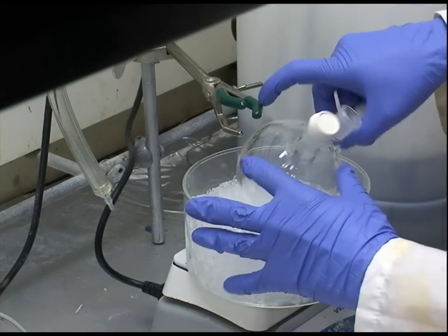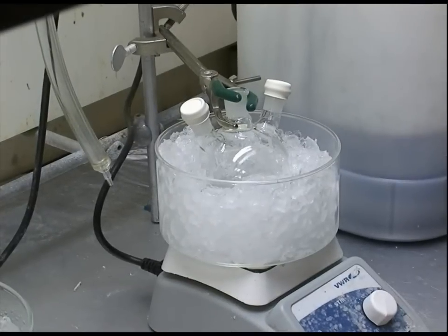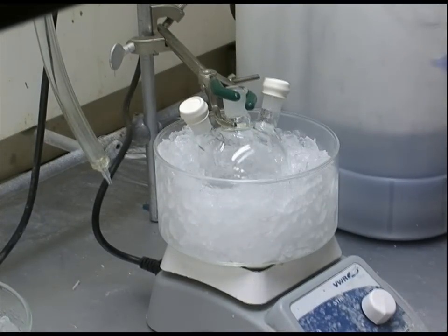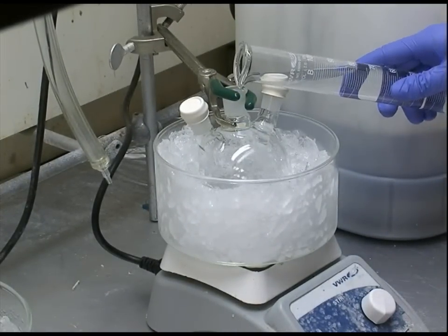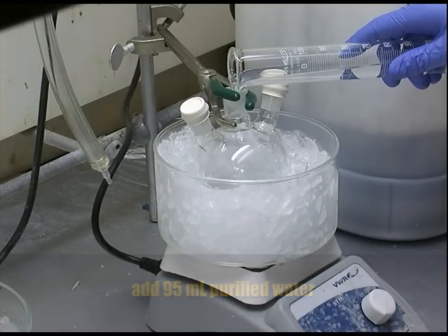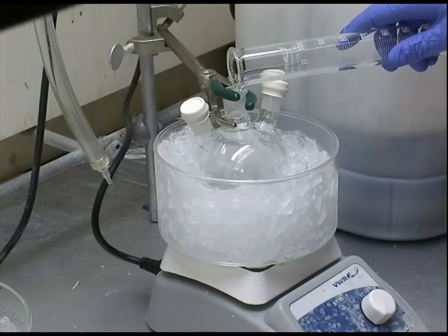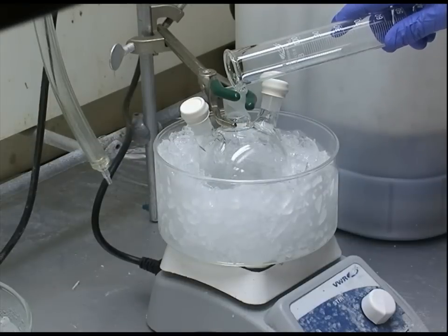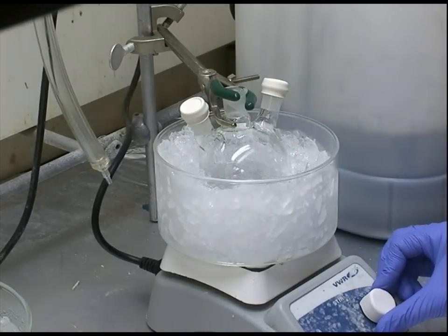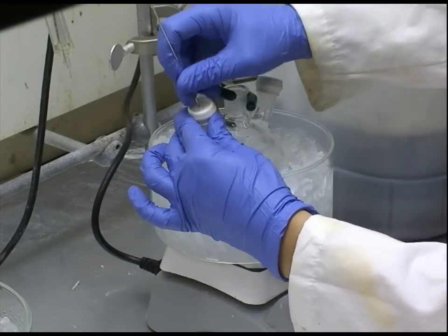We use a 250 milliliter three-necked round bottom flask and put it in an ice bath with a stir bar. We add 95 milliliters of purified water to the flask and then start purging the flask with nitrogen.